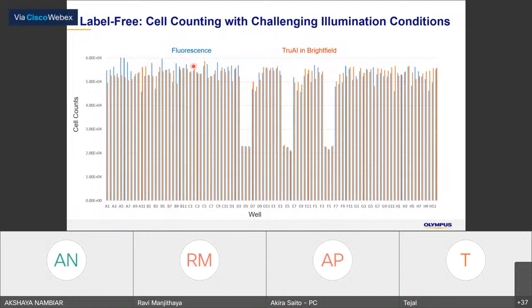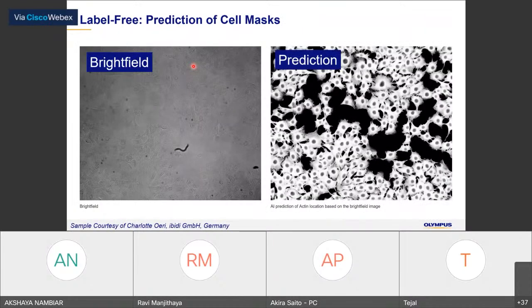So I will say it's quite accurate. So again, sorry, this is the bright field image example to find where the cells are.